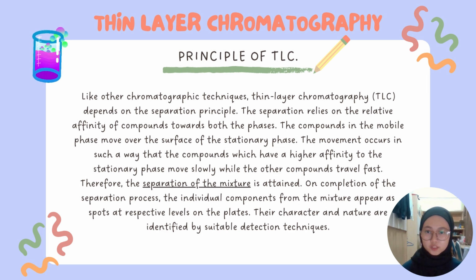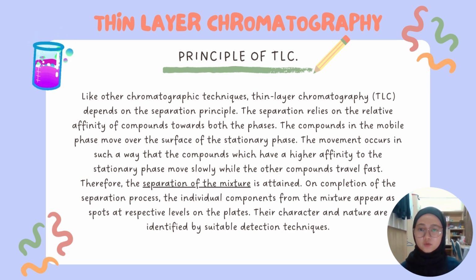On completion of the separation process, the individual components from the mixture appear as spots at respective levels on the plate. Their character and nature are identified by suitable detection techniques.